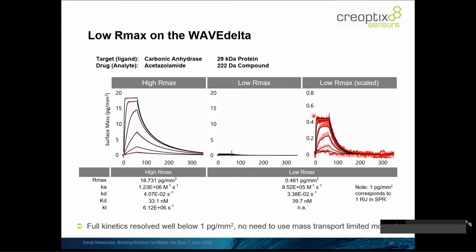That's triplicate data, so each concentration is injected in a triplicate, and we're able to resolve full robust kinetics even below 0.5 picograms per square millimeter.